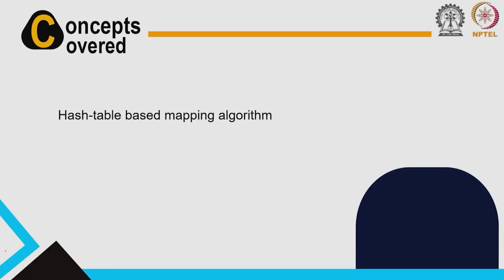This class will give you an overview of the process by which we can do the mapping. These are the algorithms that drive some of the software tools that we will use in the future classes when you do the read mapping hands on. So, it is good to know how these methods work, and also we will understand the drawbacks of this method. This is the topic that we will be discussing in this class.